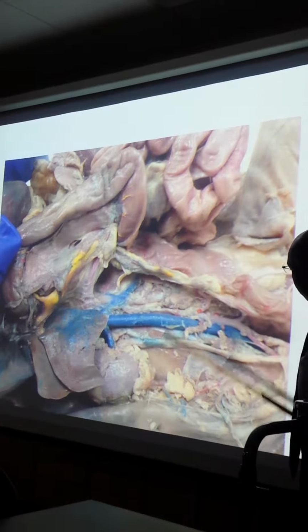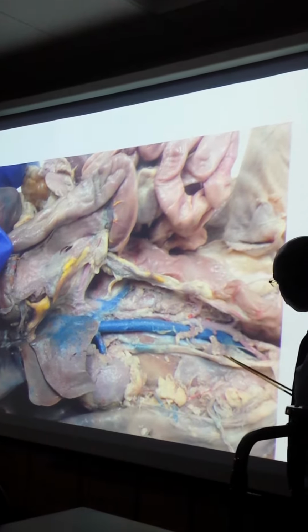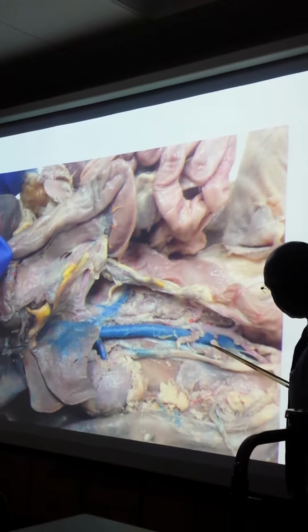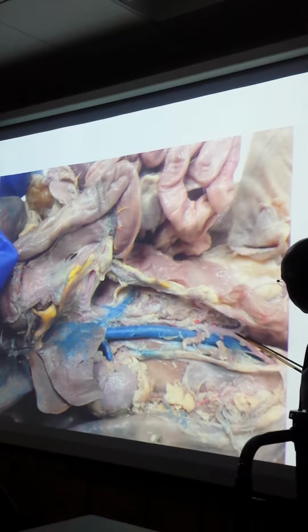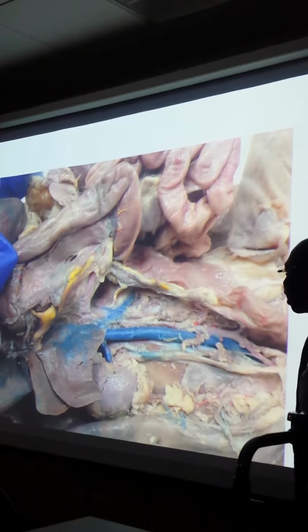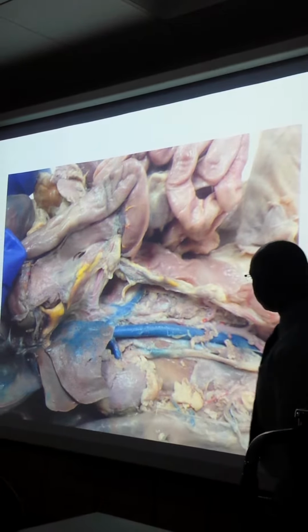All right? And this is the remnants of the iliolumbar artery and vein. There's some parts where it shows it nicely. You see, it was cut over here, but it continues over here, and the vein is kind of hidden a little bit. Okay? Because this is down at the bottom where you have the common iliac vein and, of course, the external iliac artery. All right? You can see that at least. And I won't go into the other one.